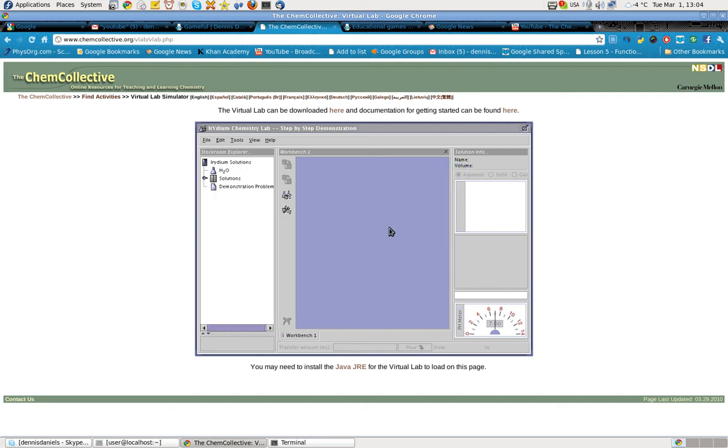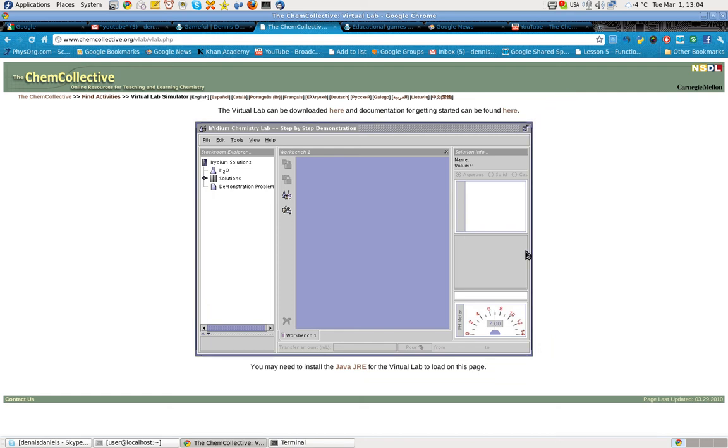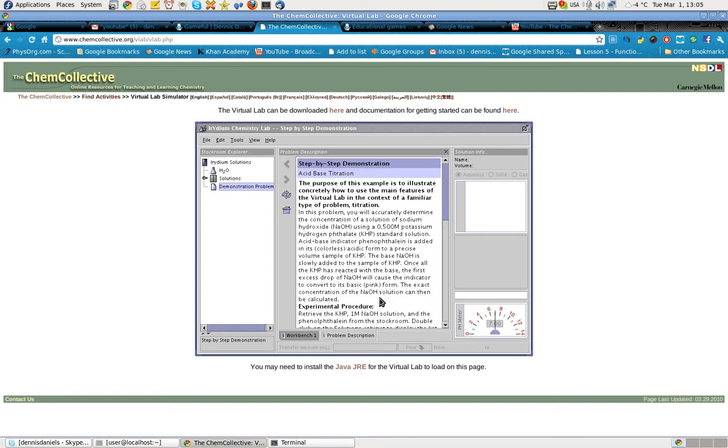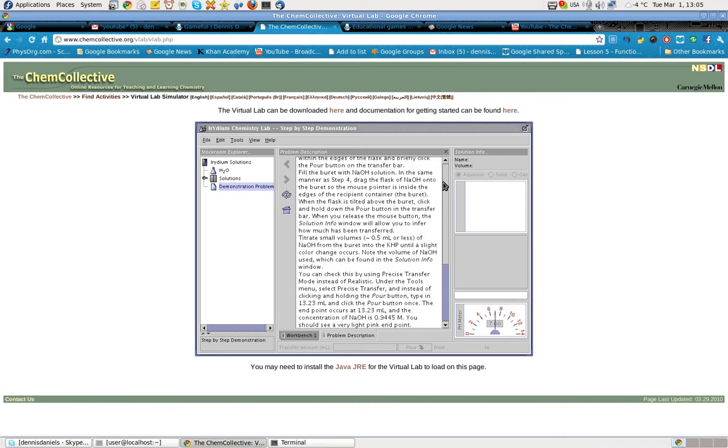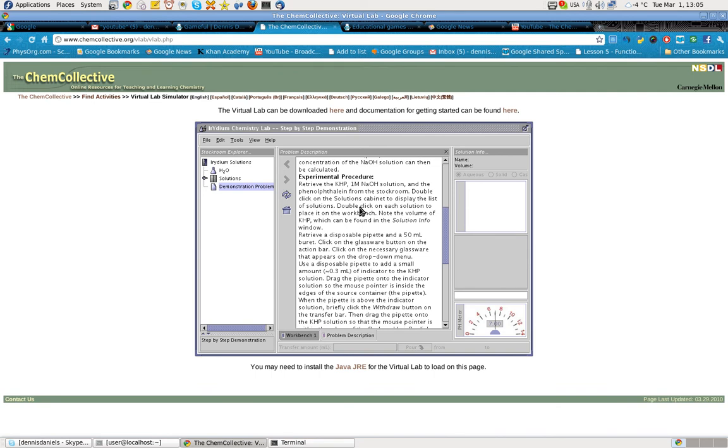Because it's going to show us how to pour fluids. We can make this bigger. No. Can I make it bigger? Trying to make it bigger. Nope. Demonstration problem. Just double click on it and it should load a tab down here. This is to illustrate concretely how to use the main features of the virtual lab in this problem. Double click on the solutions cabinet to display the list of solutions.